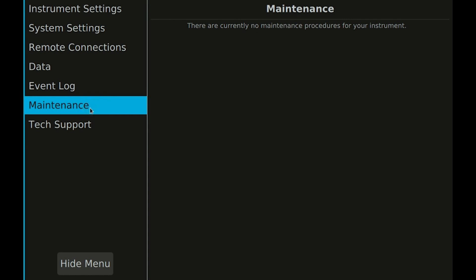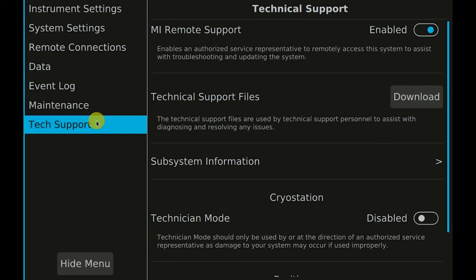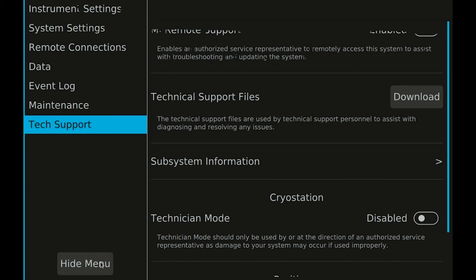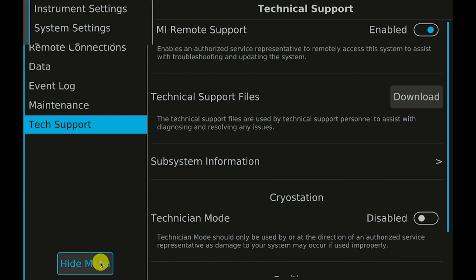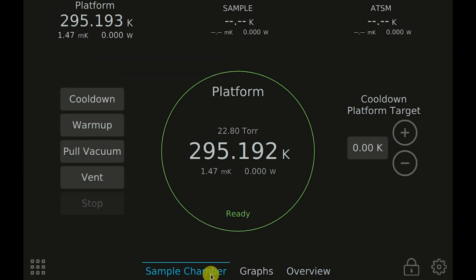The maintenance category is used to find information about maintenance procedures to troubleshoot and maintain your system. The tech support category contains information that is useful for customer service when helping troubleshoot or maintain your system. If your system is connected to the internet, MI Remote Support allows customer service to easily support you remotely and provide software updates. Use the Hide Menu button to close the menu. I hope you've enjoyed learning about how to navigate our Gen 3 cryostation user interface. Now jump in and get started.